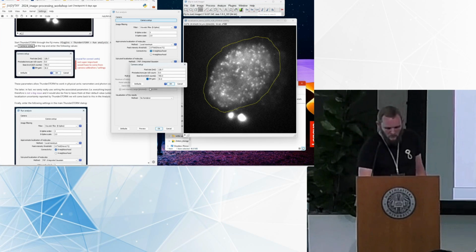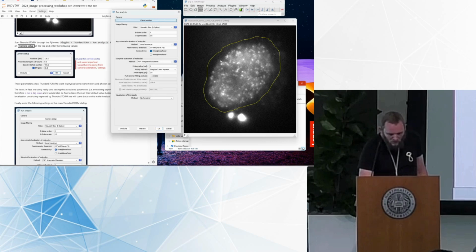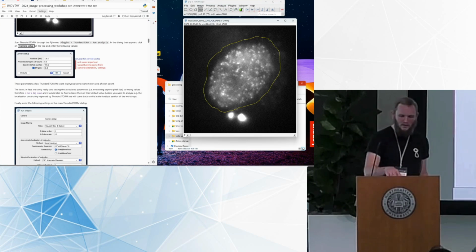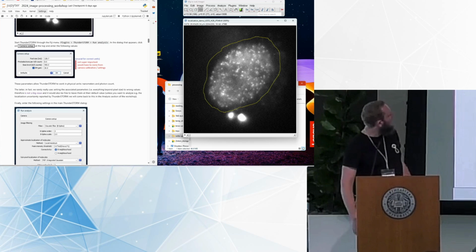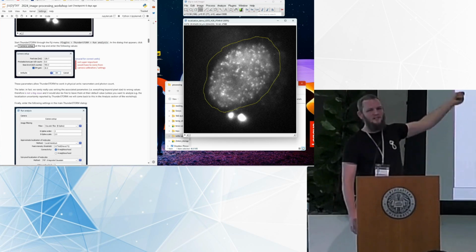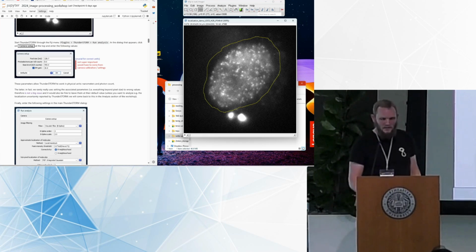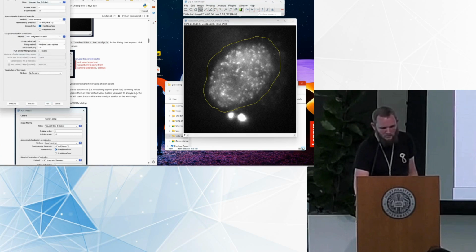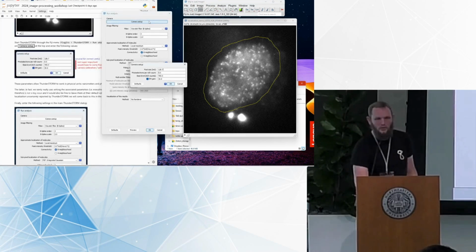So here, if I go to the image, you can probably cancel this first. In the value bar on the bottom of the Fiji main window, you see there's a value. Each pixel has a value. In this case, it's 3008. And the parameters in the camera acquisition allow Thunderstorm to convert from this pretty arbitrary value to actual photon counts.